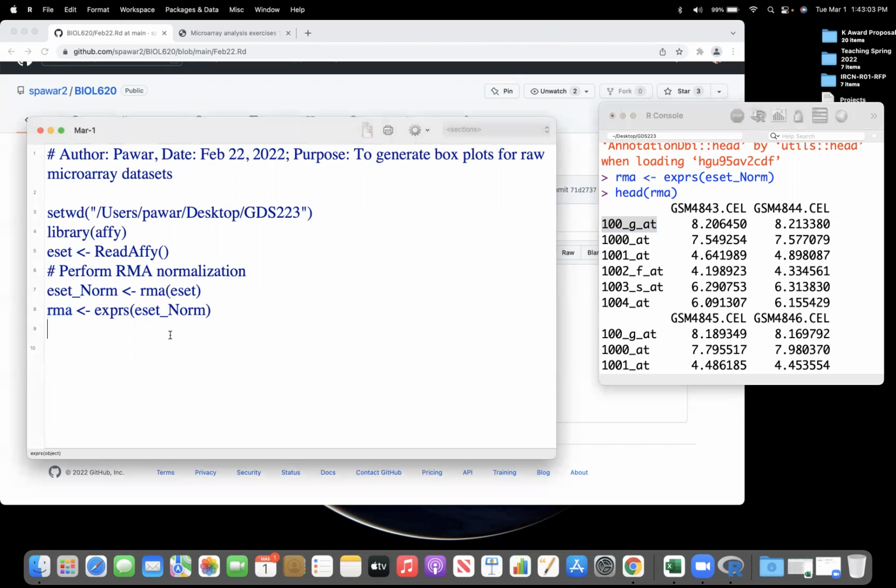So the next thing which you do is, okay, the new thing here. What are interesting genes? Interesting genes means the ones which are, okay. Definition of interesting genes.